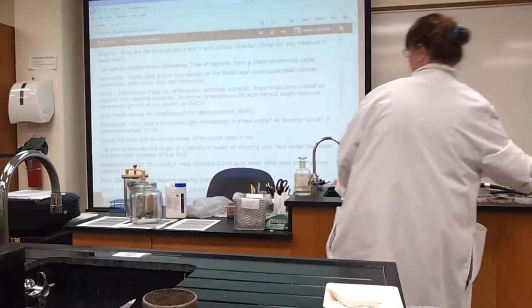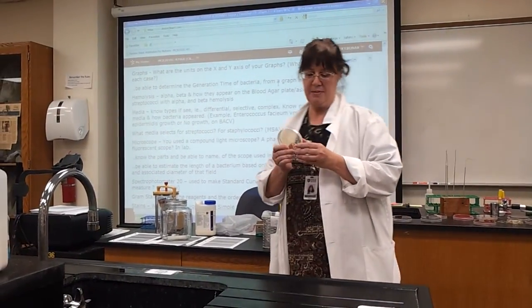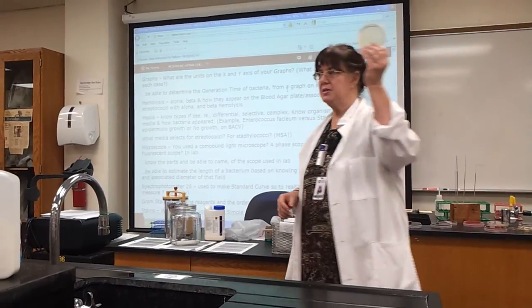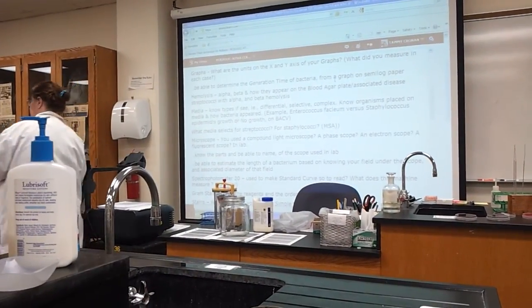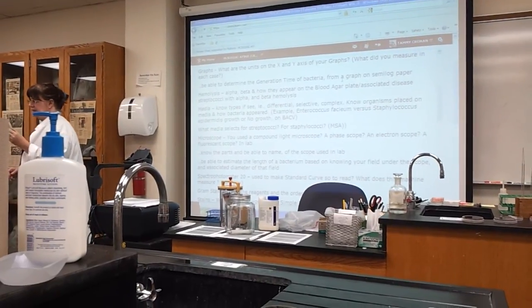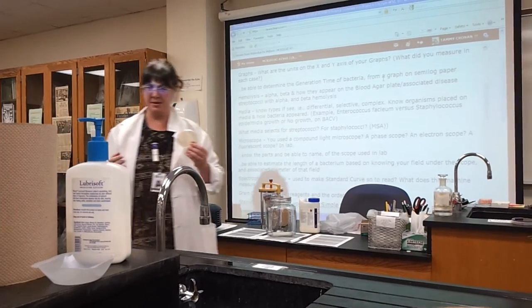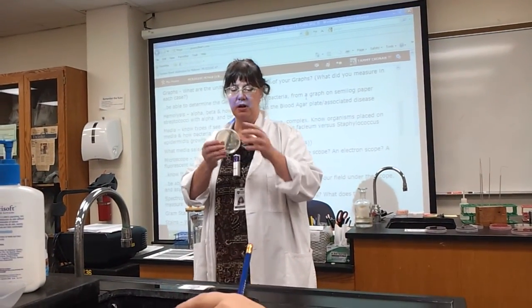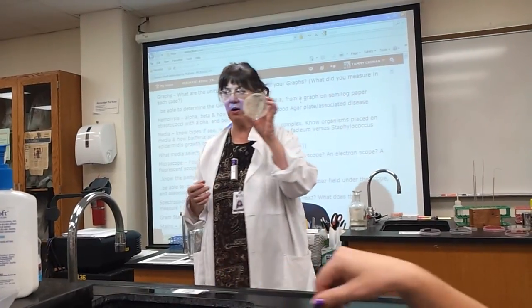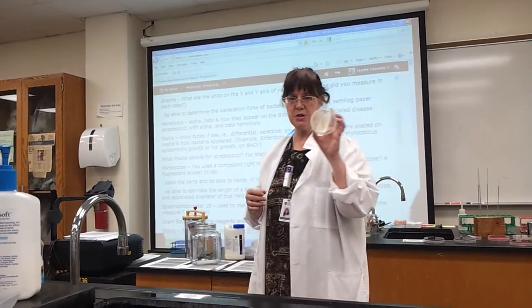That plate. Know the media. I'm not going to have it labeled, of course. What plate is this? Tryptic soy agar. Complex media or selective? Complex means grows everything. Grows almost everything. There's no such thing as grows everything. Complex. Everything grows, or almost everything. You streaked 2 laboratory cultures on this. What were the 2 organisms that you streaked?